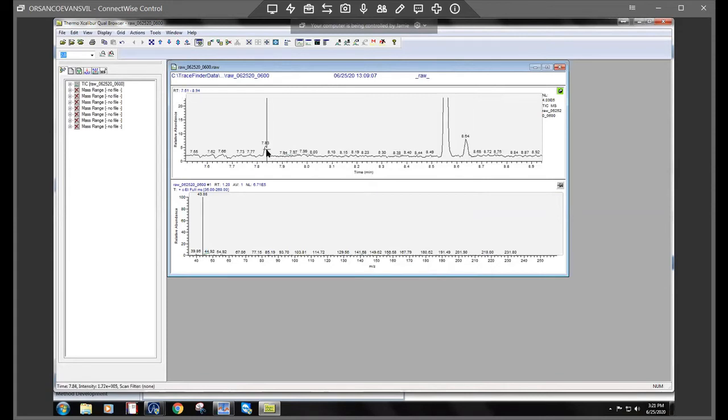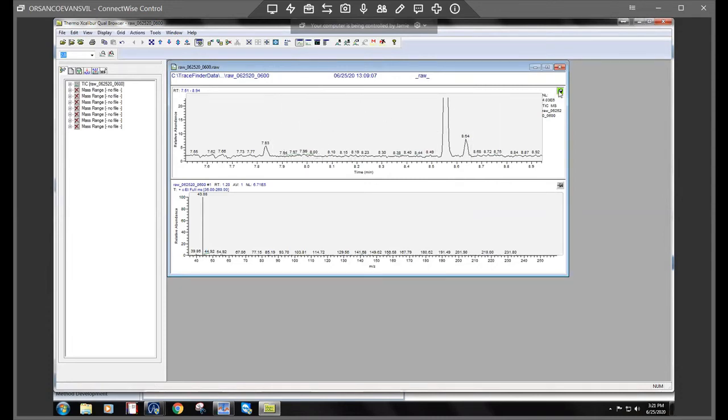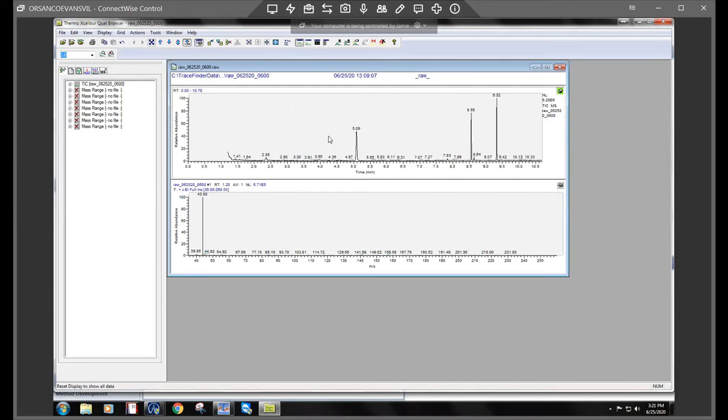You can also investigate any little peaks as well. If you want to go back to the full screen, while this pin is selected, you can click on this kind of X looking shape and that resets your zoom. So it goes back to your full size.